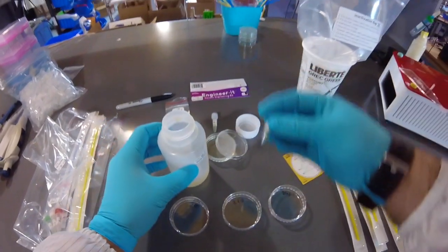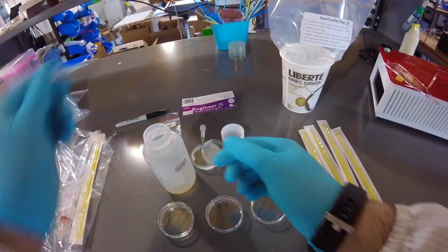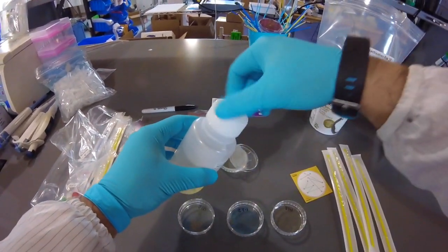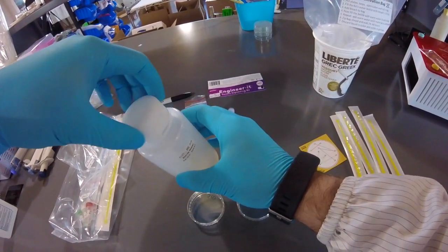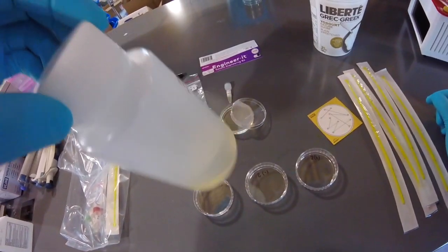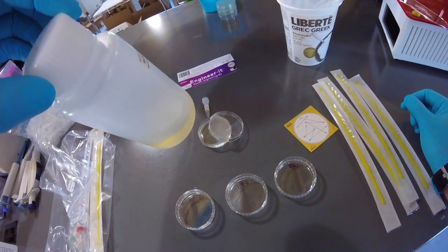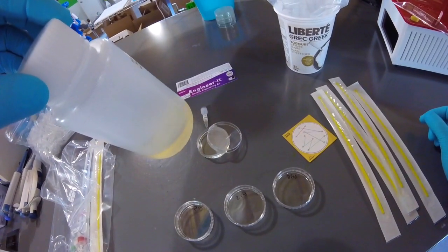Okay, so now we can pour in the antibiotic. I'm going to pop that lid off and just pour it in. And I'll put this into the baggie so you can see it in there. I'm going to put the lid back on just to help limit contamination. If it's too hot, you can hold the lid while you gently swirl. Just gently swirl and let it sit for a moment. Gently swirl the other way. Gently swirl.